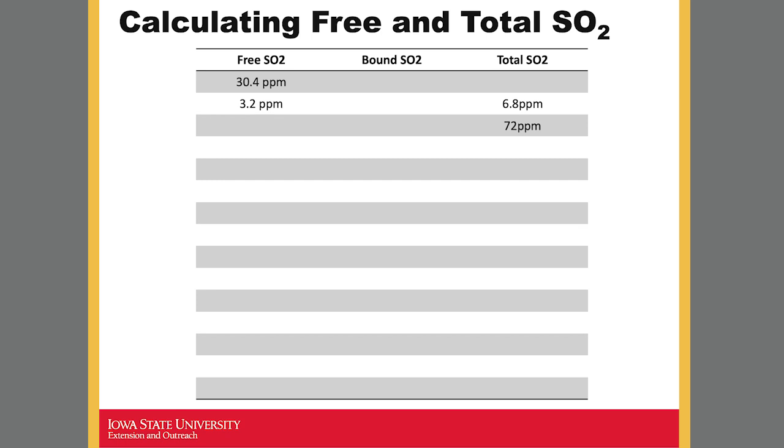If that was a wine that was just at bottling, I'm going to explain how much SO2 we will need to add to make sure it's protected. Because right now, 6.8 ppm, that's in a wine that was open, so it's not a big deal. But if that was at bottling, that would be really too low. For Pinot Noir, we had total SO2 of 72 ppm.